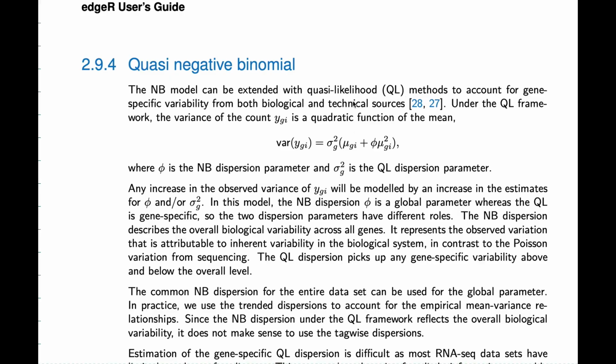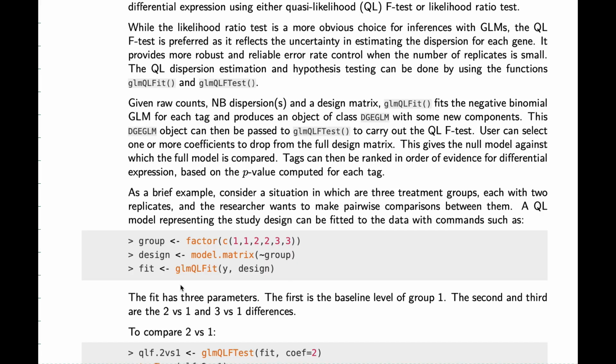QL abbreviation comes from quasi-likelihood methods, and the glmQLFit function is more integral compared to glmFit. It does not require a separate line of a dispersion analysis.